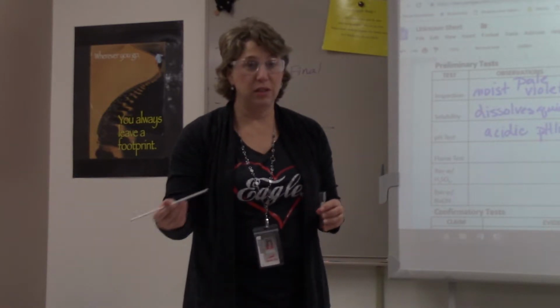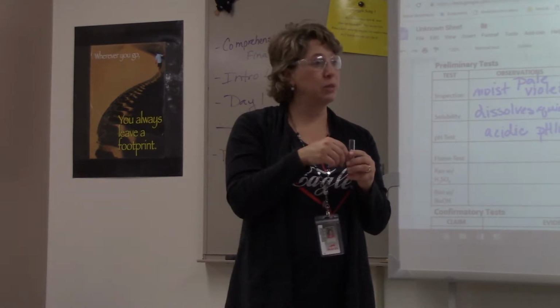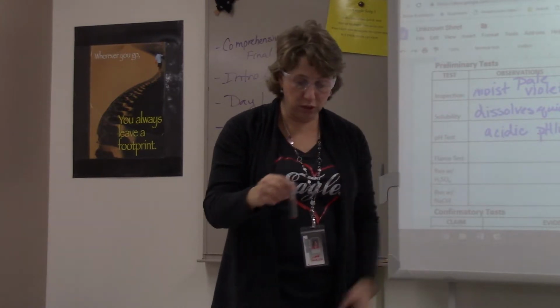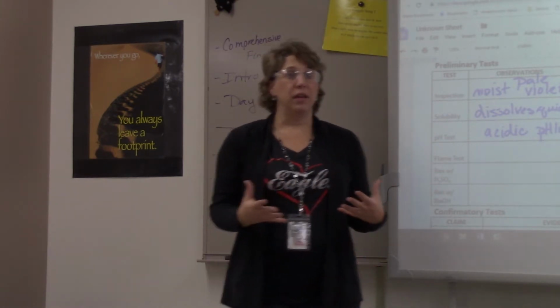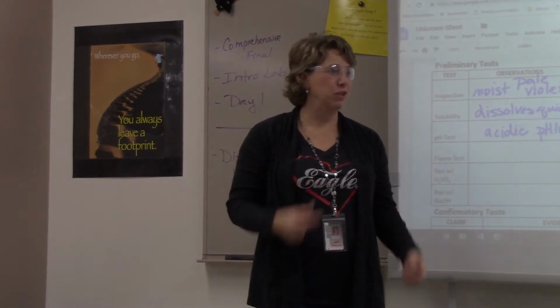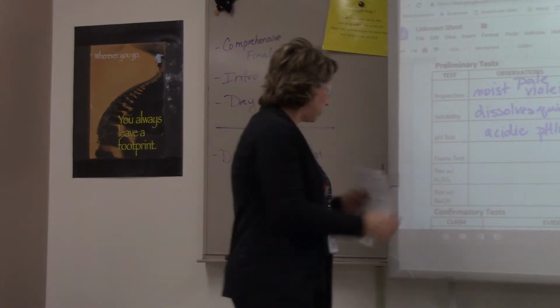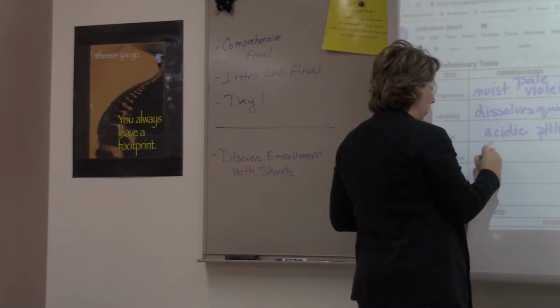I would typically do this in a Bunsen burner, and it tells you how to do that. If you're having a hard time, can you also soak a wood splint in here, like we did in the actual flame test lab, and use that to burn? Absolutely. Okay, I'm going to tell you don't eliminate something based on a flame test, but some of you are going to get some things that are very obvious. In fact, what would probably be a very obvious color that instantly would tell you what we had? Green. Green, and that would mean we had what? Copper. Copper.